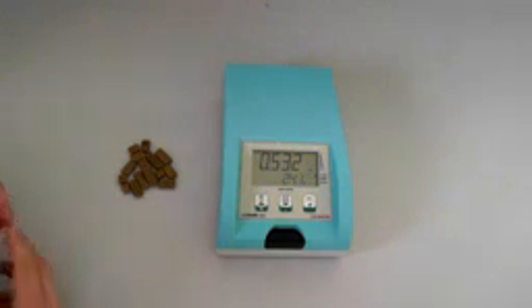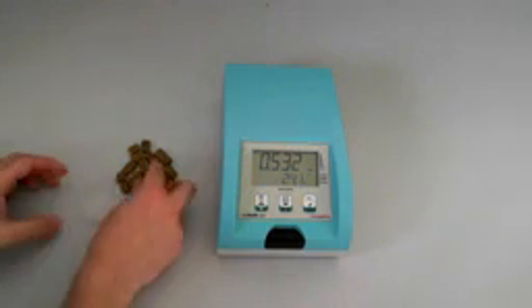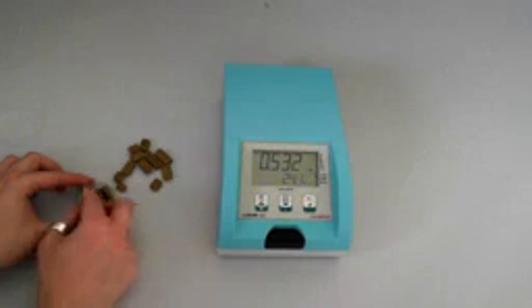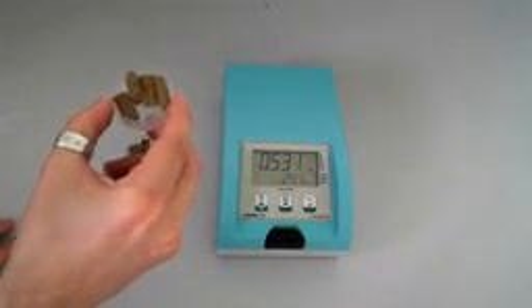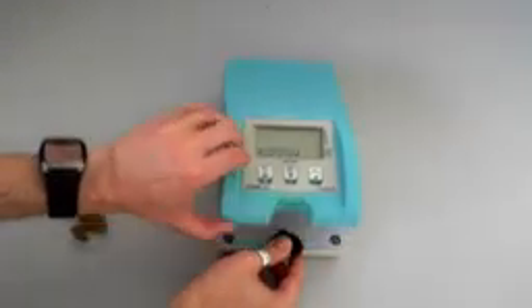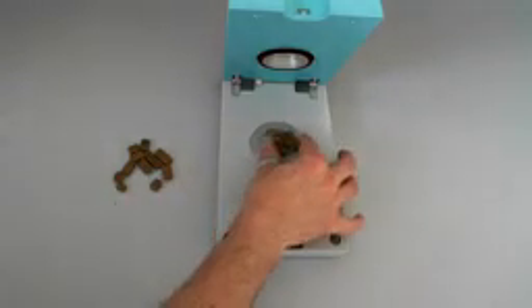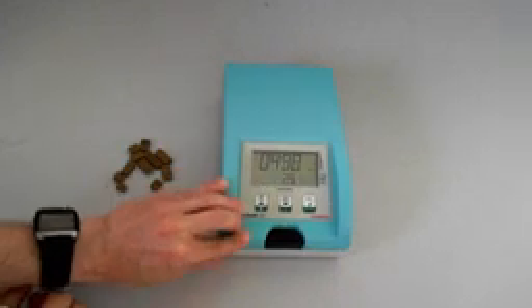Sample preparation is not really required. We just need to open the sample cup, place some samples into it like this, so we have a few samples in there, and then open the instrument, place the sample cup into the instrument, close the unit, and press the start button.